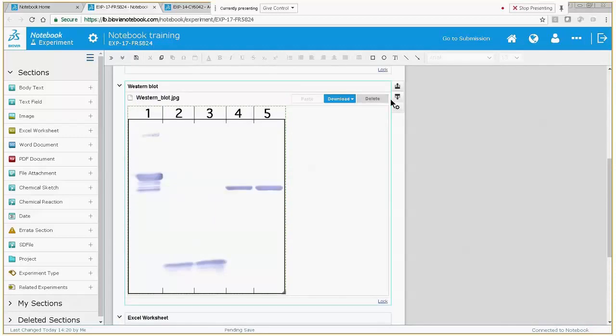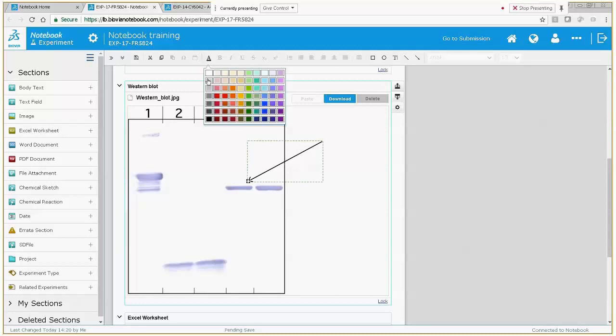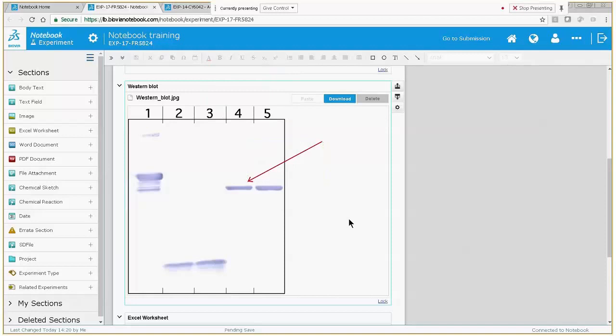And also we have these simple annotation tools up here where you can add squares, text, lines, arrows, etc. So I can add an arrow, I can move it around, I can even move it here in the space next to the image, and I can also then grab the pointed end of the arrow and move that. Select an arrow or any annotation and you can change the color if you need to. We can add some text.